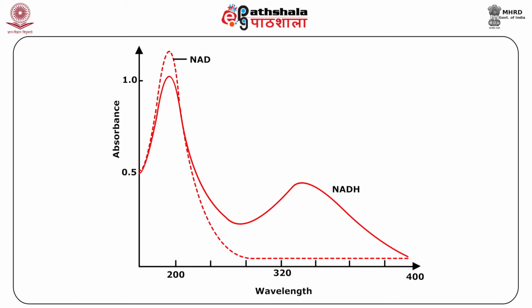Now, the spectra of NAD and NADH2, as you can see, make it clear from the figure that if the absorbance is measured at 340 nanometers, the readings will increase as the reaction progresses towards the formation of NADH2.